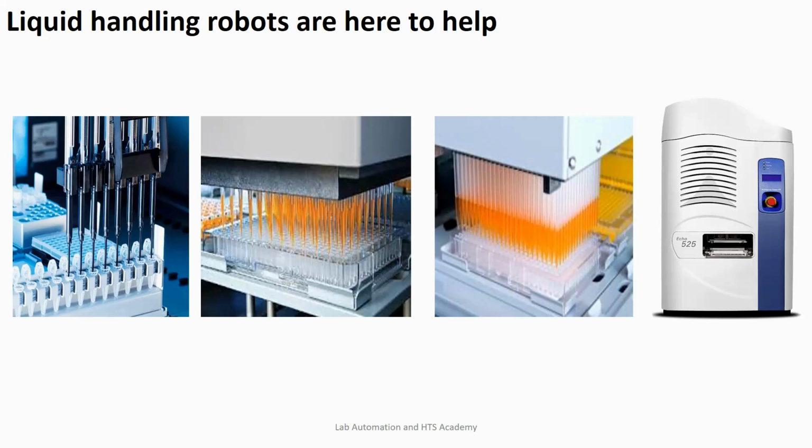And there are even new liquid handlers that don't touch the liquid and still transfer it. For example, I have an Echo 525 here that is using acoustic technology to transfer liquid without even touching it. That's amazing, right? I mean, it's a new dimension of doing experiments.